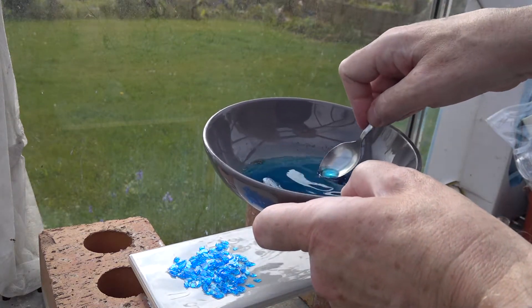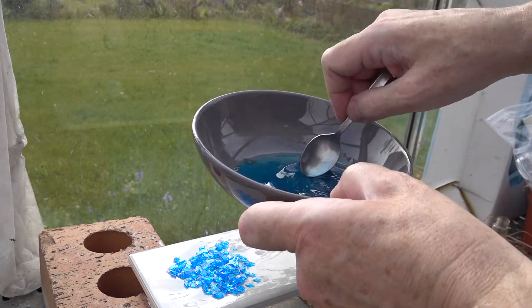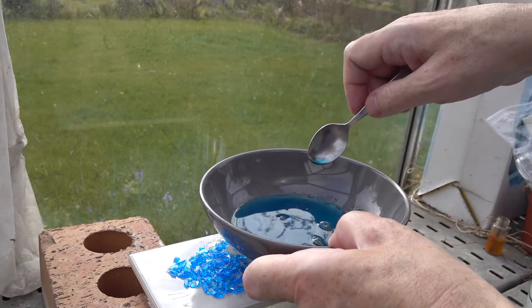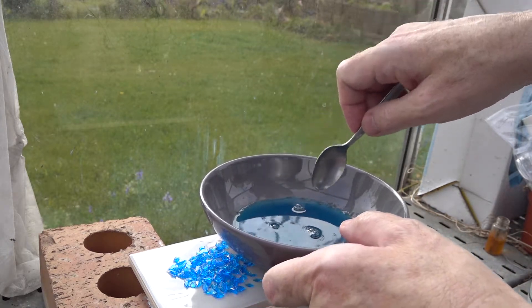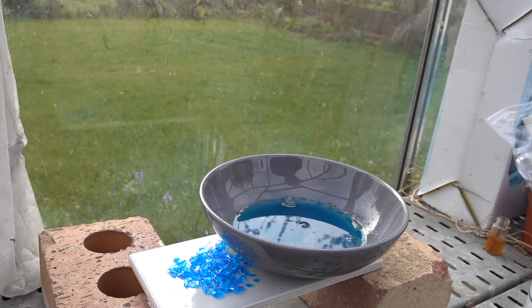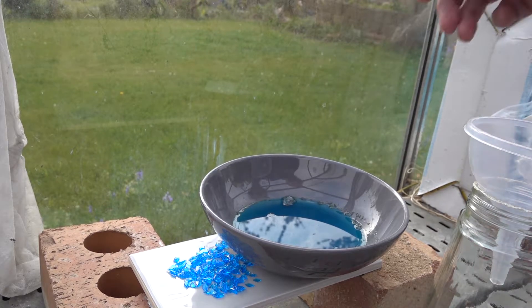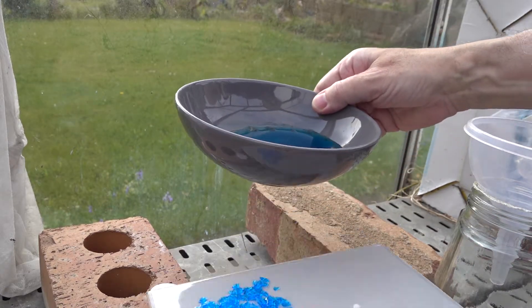So there we are — just breaking up one surprisingly large crystal in the bottom there. That's now dissolved. So we've got a copper sulfate solution, and we need to separate the dissolved material from the insoluble contaminants. And we do that, of course, using filtration. So let's just remove the pure material.